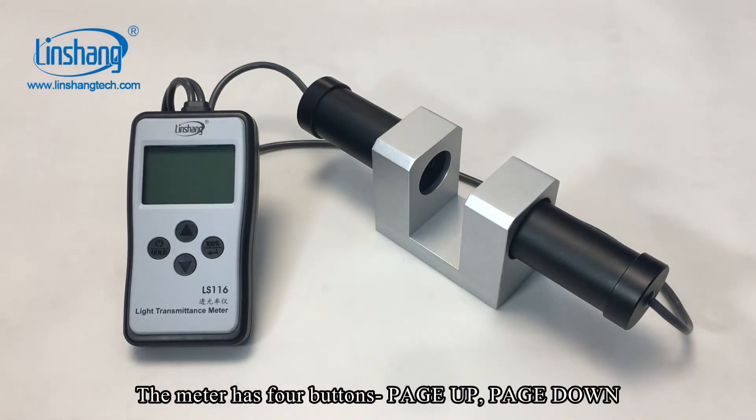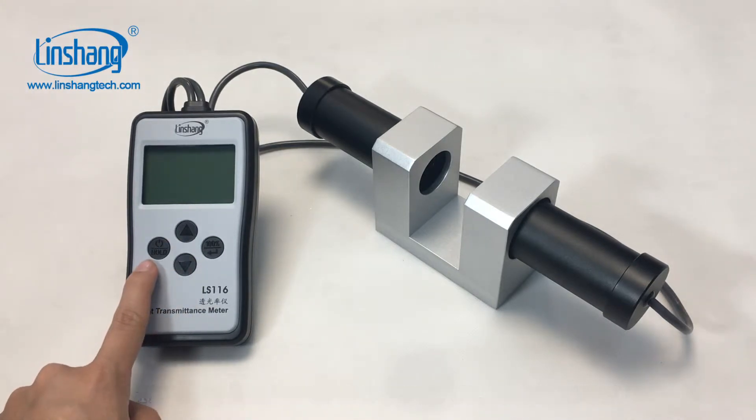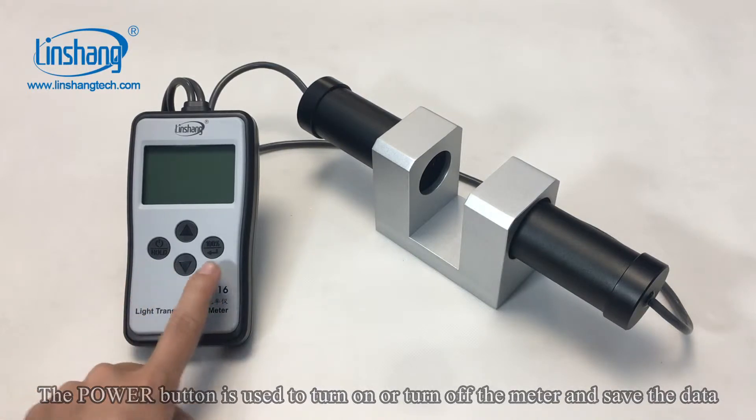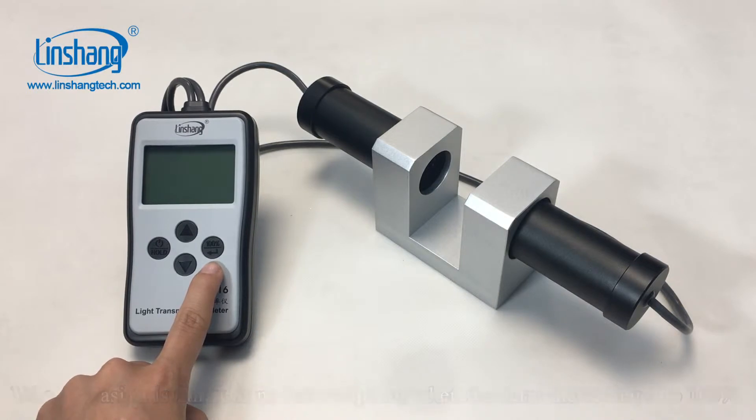The meter has four buttons: page up, page down. The power button is used to turn on the meter and save the data. The confirm button is used to confirm the setting.